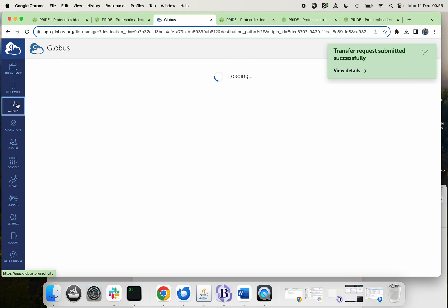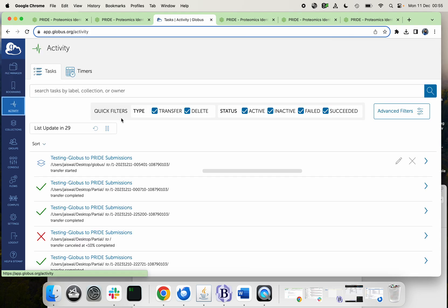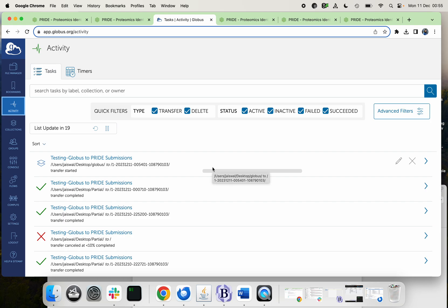You can go to the activity log and check here that it has been initiated, but it's not submitted yet. So you have to wait for the process to complete. Of course it will take a little time depending on the file size and your internet speed. Always make sure that your Globus app is running.